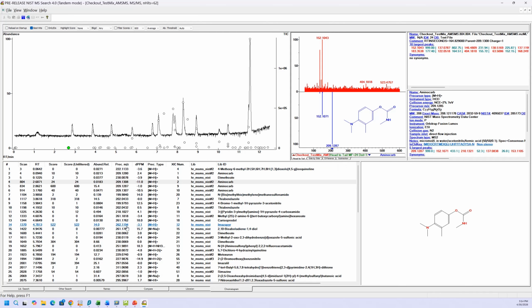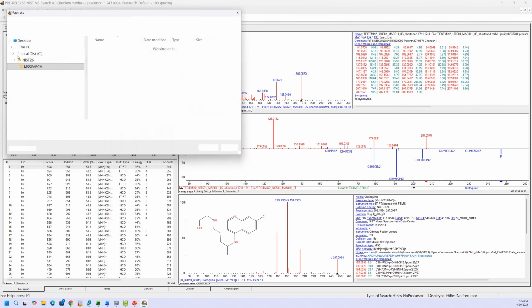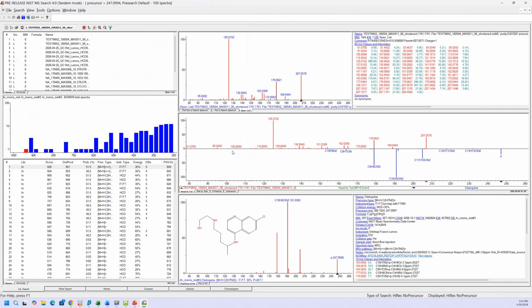And after you do that, you need to make sure that you save things. You can save all of your settings with all the windows by just going over here and saying File, Save Configuration. You'll see there are a couple here that they give you as standard when you get the software, but you just say Save Configuration, put your name in, and then when you come back in, you just open your configuration, and you won't have to start all over again. You might have several different configurations for different needs, depending on how you're processing the data. I find that very handy.